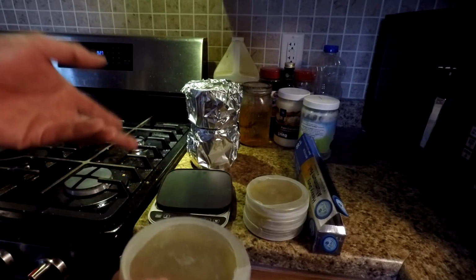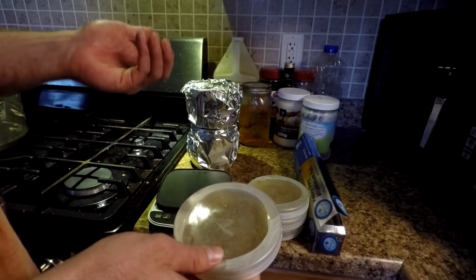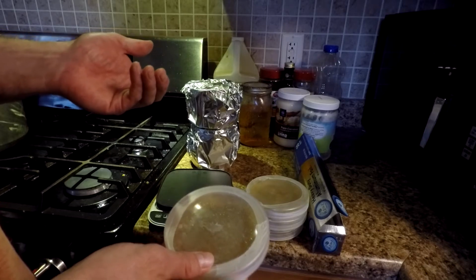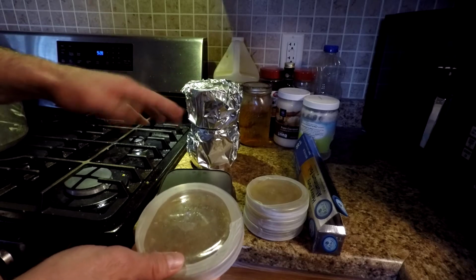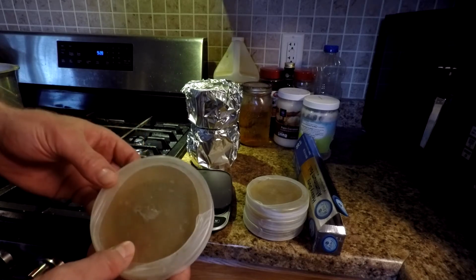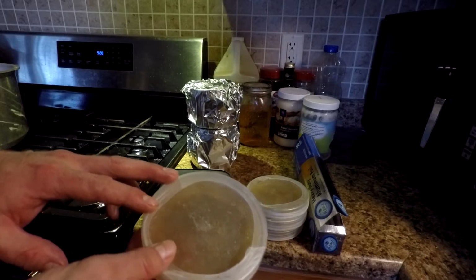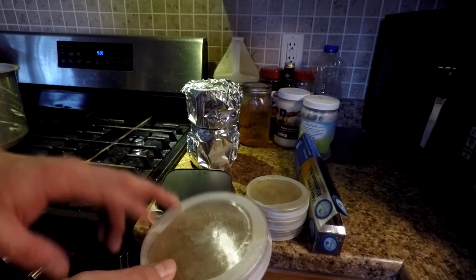So to get the condensation out of these dishes, what I have to do is first get the temperature up in my lab room, which now I have it up past 70 degrees with the space heater, and somewhere between 70 and 75 is really where you should be keeping the lab room when you have cultures in bags. And I'm going to let this agar that I make the dishes with cool down for about another hour before I open up the pressure cooker.